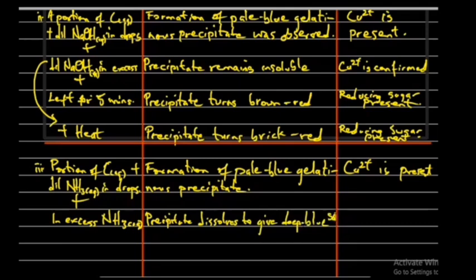This confirms the presence of Cu2+. So this was the test we carried out using aqueous ammonia.